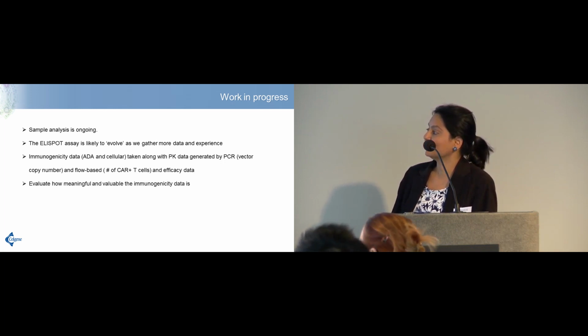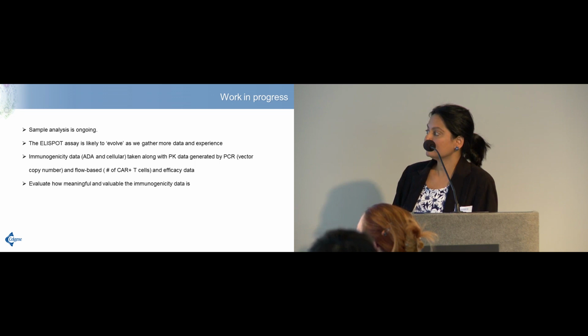As Priya mentioned, we were a little bit skeptical as to whether that was going to be achievable with regards to background, particularly as being a challenge. But actually, we were pleasantly surprised. And we've also factored in, because when you plan for these sorts of assays, the number of years that it's going on for, you also have to think about different batches of peptides that are going to be used in different arms of the trial as well. So we've also had to think about bridging studies for new batches of peptides.